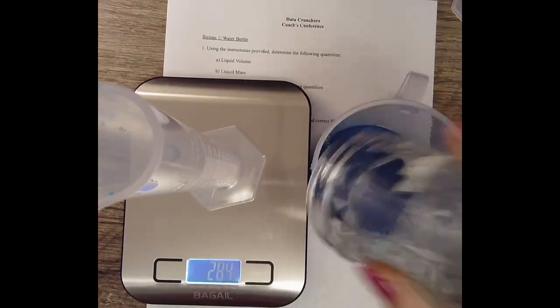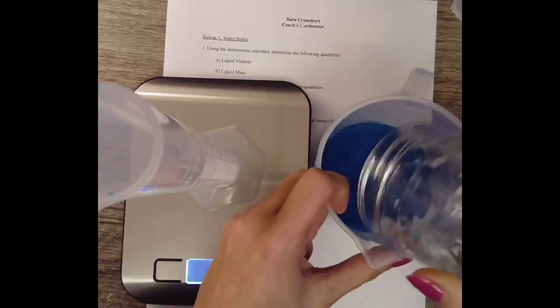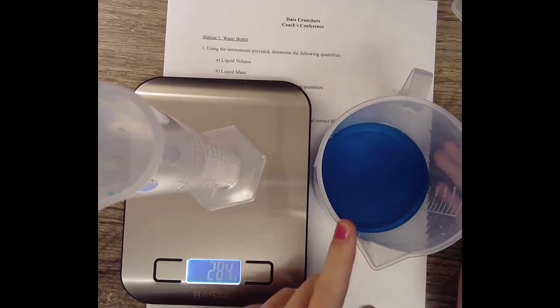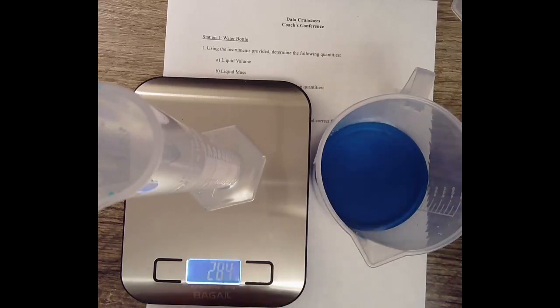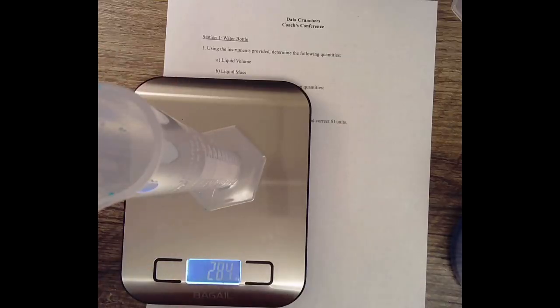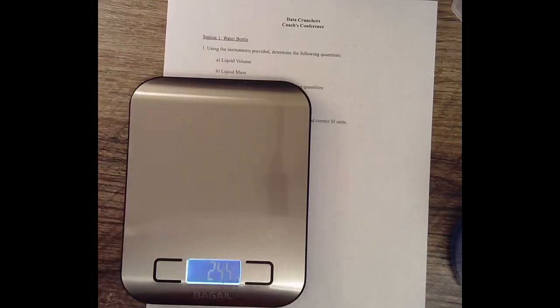Make sure you get as much as you can out. I'm going to kind of tap it on the side. Now you have a nice lip, meaning you can pour your liquid easily. Now, notice my scale right now is not set. You're going to want to reset it by hitting the on button. Now it says 0. I have mine set to grams. If your paper asks for ounces, then you're going to want to hit the unit button and change it to ounces. I'm going to change it back.